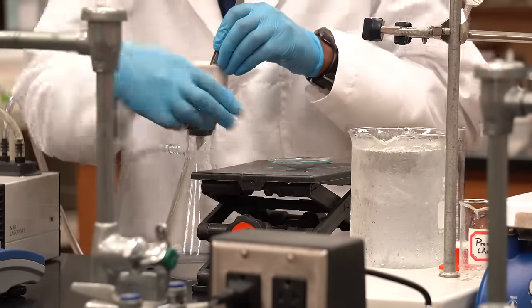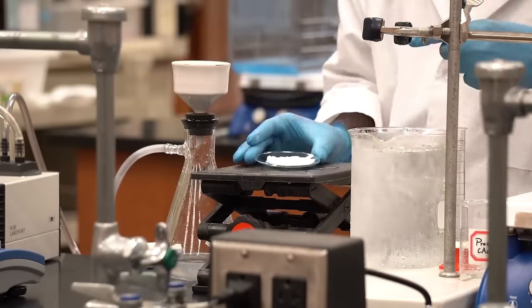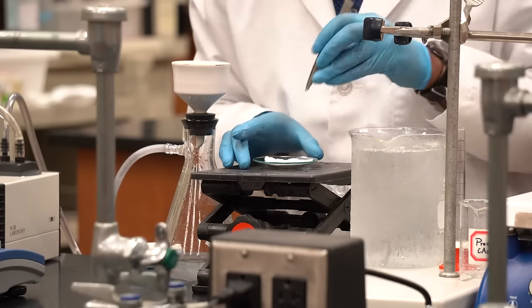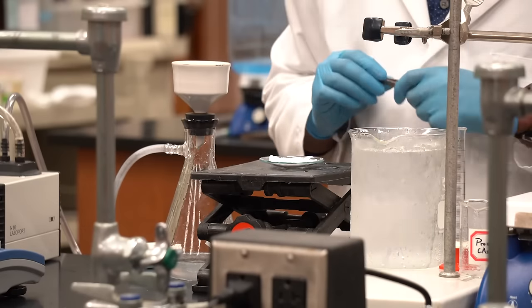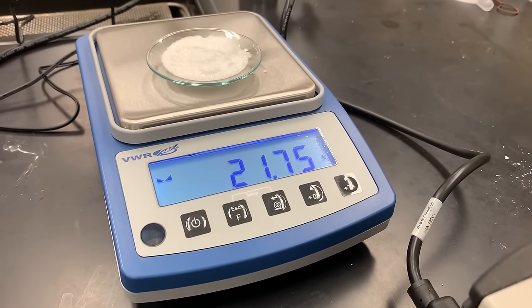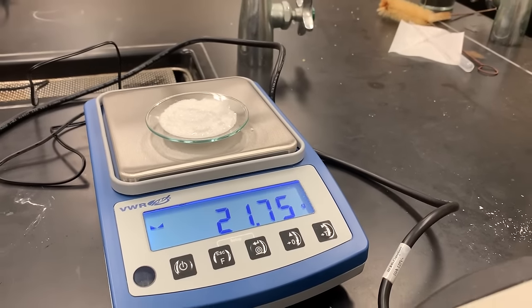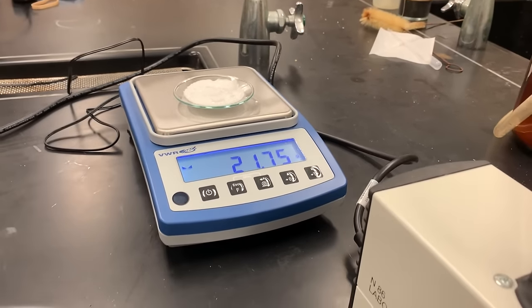We can then put our filter paper with our product on the watch glass and leave it at room temperature to air dry, or use the oven at 65 degrees celsius for 20 minutes. After you get a dry product, let's place it on a scale to weigh it. The mass of your purified sample is calculated by taking this number and subtracting the mass of the watch glass plus the filter paper that you measured earlier.